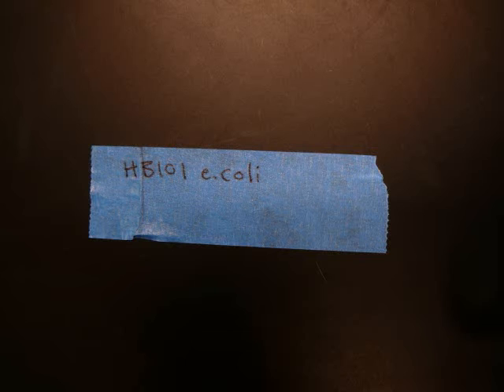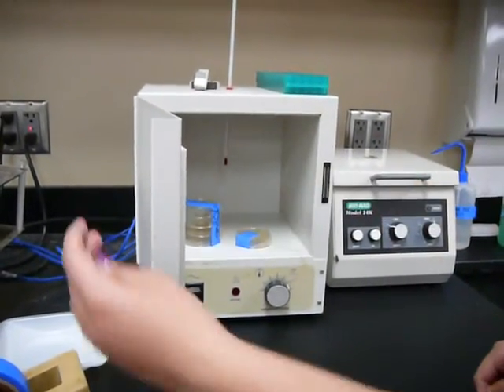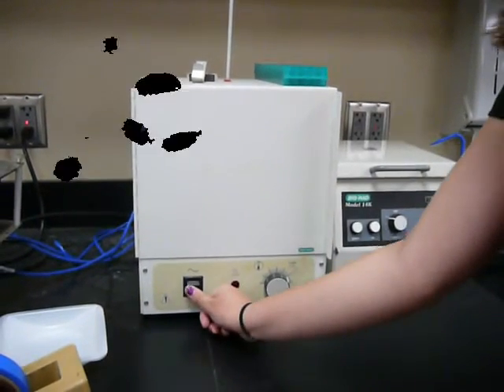On a piece of tape, write down the contents of the plate, the date it was streaked, and your initials. Add this piece of tape to the plate. Put the plate in the incubator upside down and incubate overnight at 37 degrees Celsius.